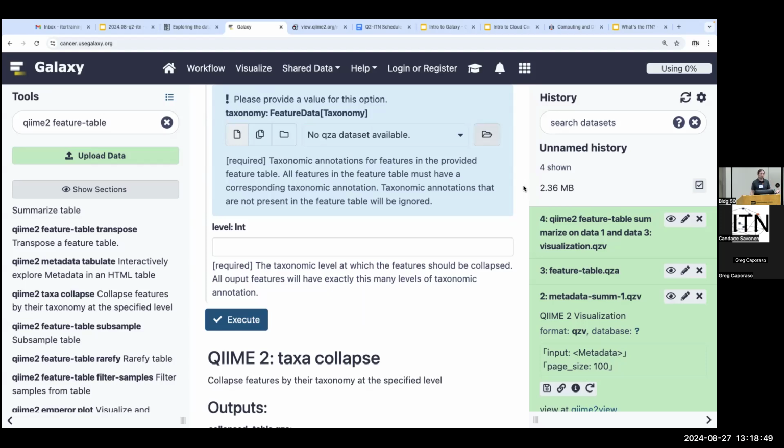If this was a phylogenetic tree in an artifact, it might be a Newick file that you would find in that data directory. So QIIME's not really doing anything magical in terms of what these files are. It's just that by putting them in these data artifacts, we can associate other metadata with them that is relevant to the QIIME2 system.